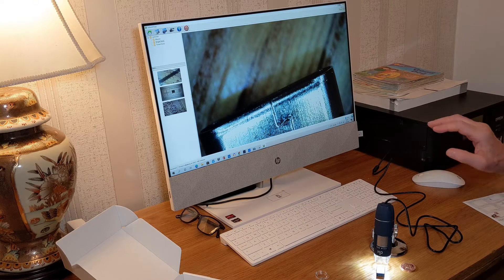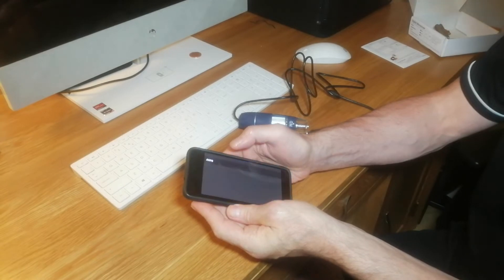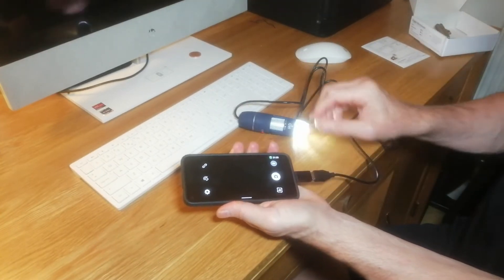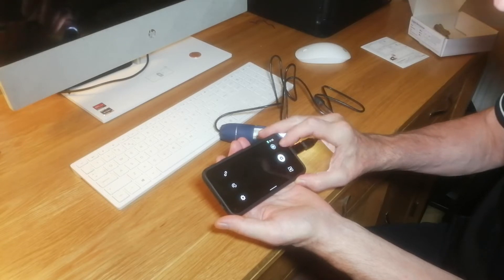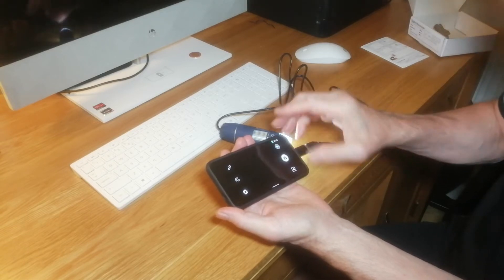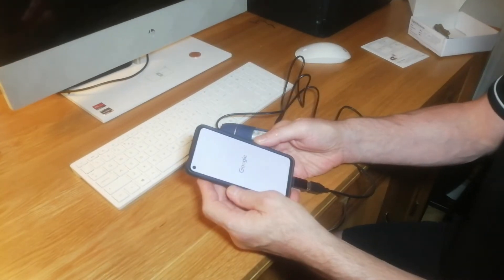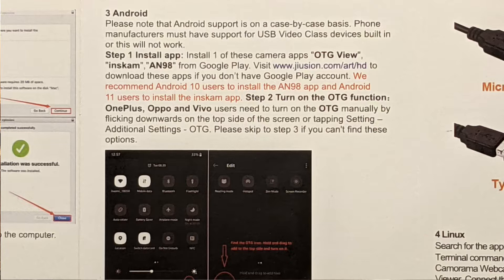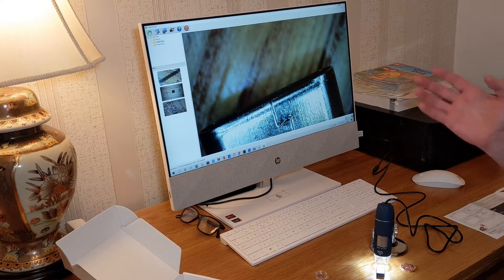I did try and use it on my phone, but the problem was it says you can download three types of app for your Android phone and none of them would work. I tried to load it up, the camera light came on, but nothing happened. When I tried to press anything on the app the phone just crashed and rebooted. I've got a Google Pixel 4a, so maybe it just doesn't work with Google phones. The three apps they recommend were OTG View, Instacom, and AN98 - none of those three worked.